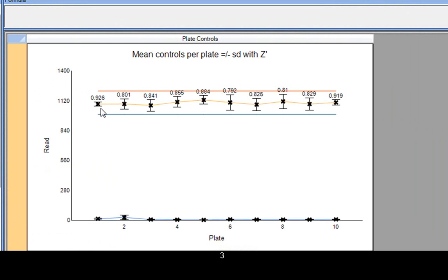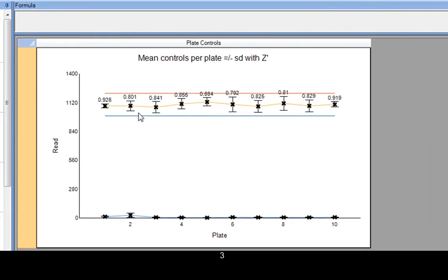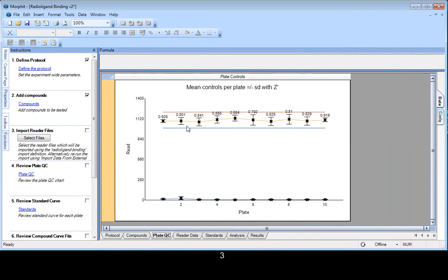And if you look at the plate QC now, we'll see that the second plate is now providing a more acceptable solution. Now, again, this type of thing can be automated, but we've tried to keep things simple in this case.